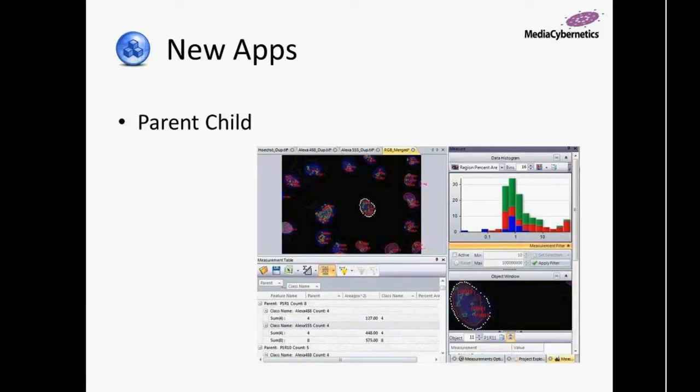Again, all of this can be exported to Excel, sent out to a text file, or you can look at it in our data collector for multiple iterations of the same type of image, and then you can look at statistics over an entire experiment later on.